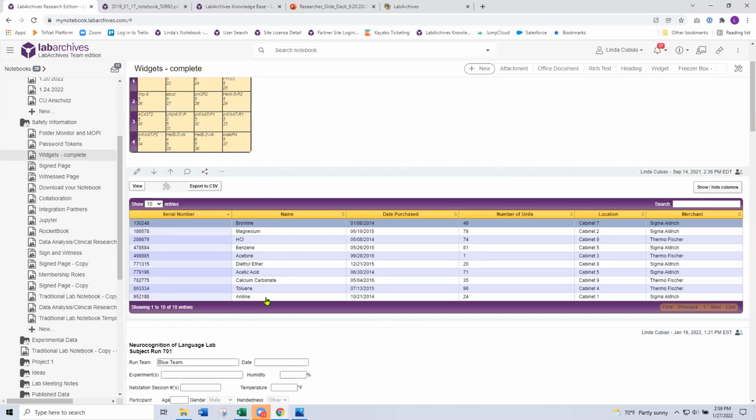Now it's still going to create a separate entry, but that's something to think about as well. Your other options, Nicholas, maybe you want to look at how you format your pages, your folders, for example. It would be difficult if you don't want separate files for each of those CSVs, though. If they're not separate files, you lose the searchability, I believe. It's when it's a separate entry that something becomes searchable. So we might have to get together and brainstorm a little bit more on that. So Nicholas, maybe shoot a ticket over to our support team if you want to talk about that offline further.